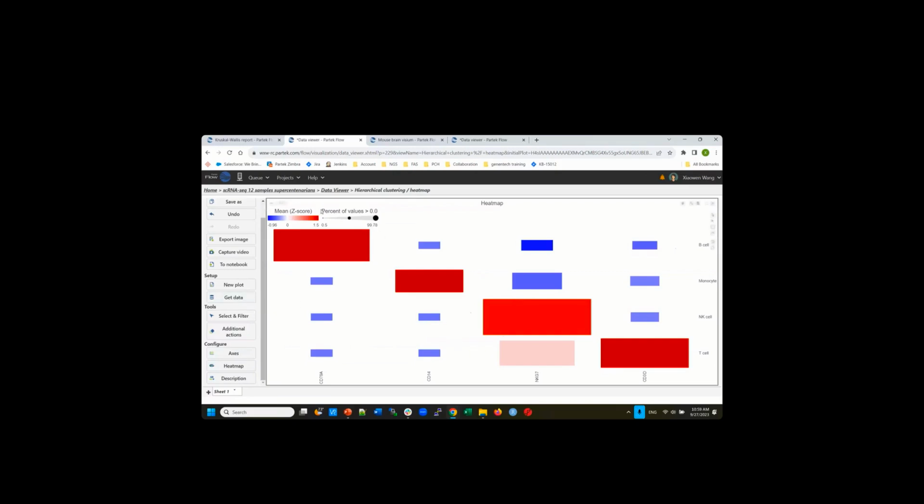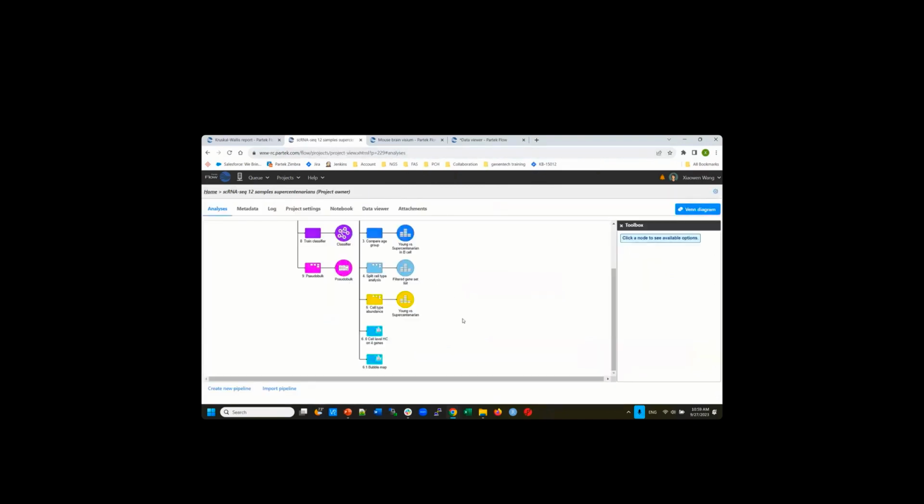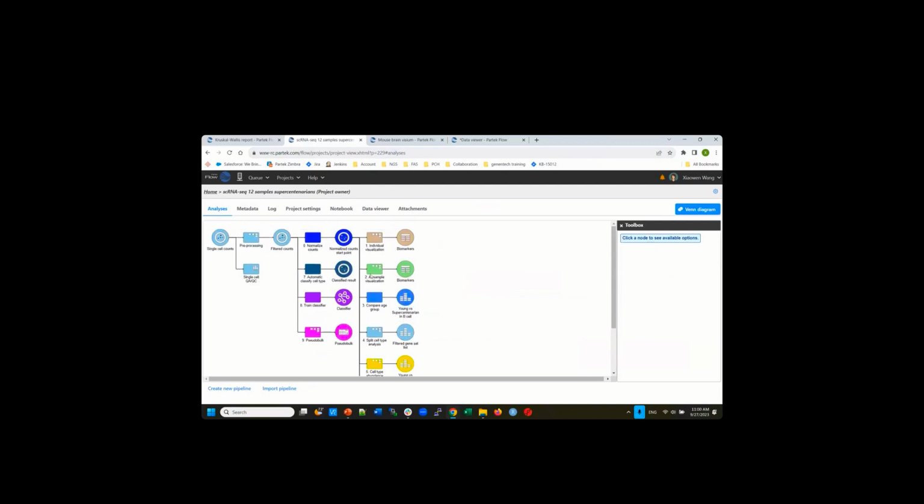Okay, so of course, these techniques can be utilized if you only have one sample for the visualization. So now we talked about multiple samples, classifying cells using the different techniques, and after you classify cells, what you can do. Also, a lot of users want to do automatic cell type classification. So you have to think about that.